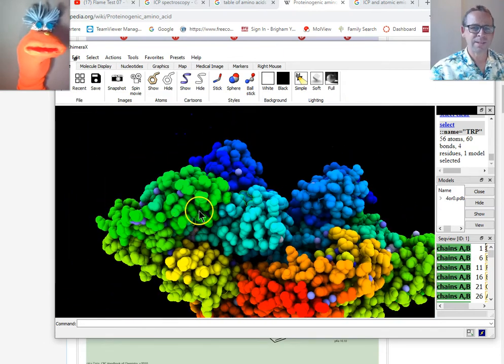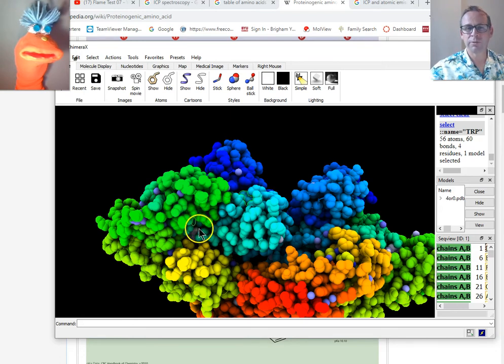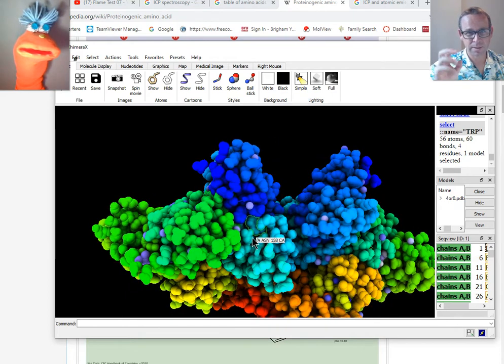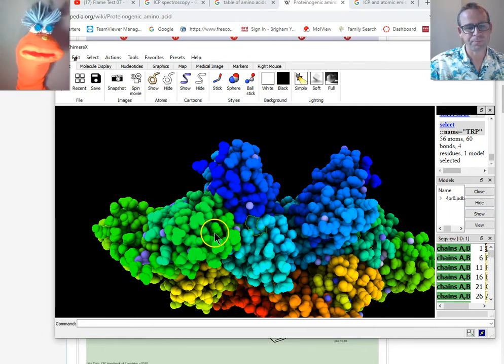So that accessibility will change its capability to fluoresce, because it's altering its capability to absorb light, right? So if the light gets diffracted or absorbed by other proteins here that don't fluoresce necessarily, then that tryptophan in there is not going to fluoresce as well. So in other words, there's a difference in the amount of fluorescence between tryptophans that are near the surface, where they're going to be hit by electromagnetic energy more directly, than those that are buried. All right.